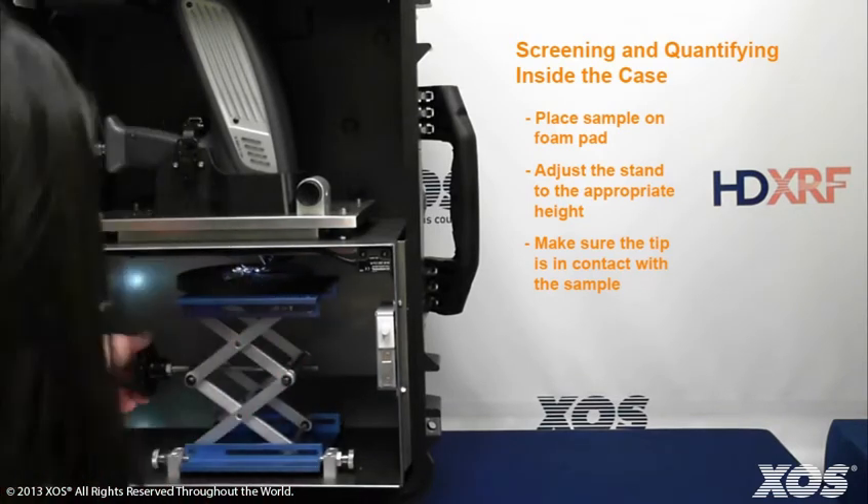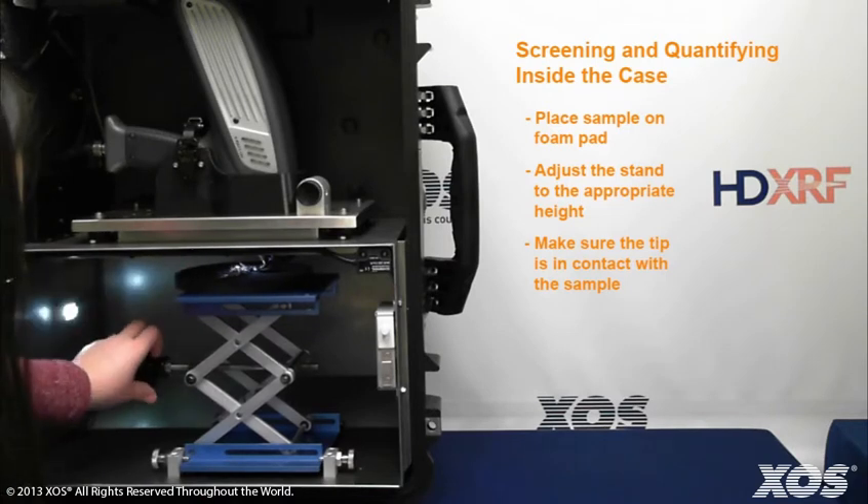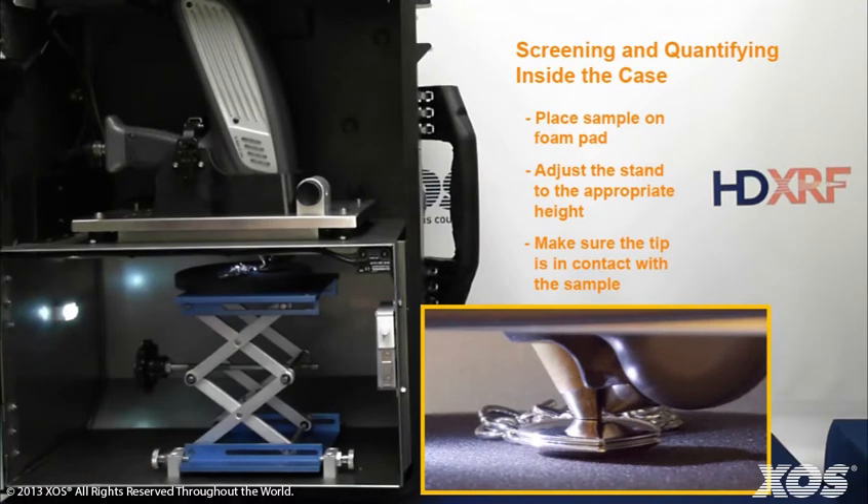Use the scissor jack to bring the sample into contact with the tip of the gun. Once the tip of the gun is in contact with the sample, close the chamber door.